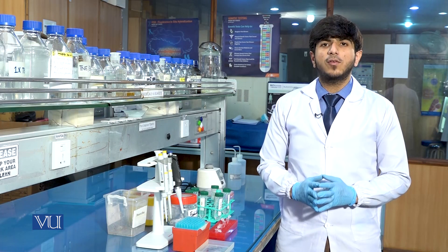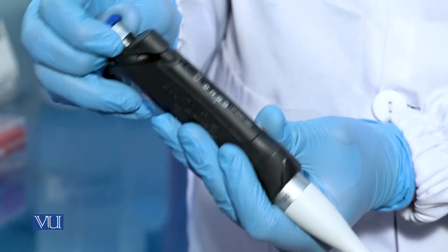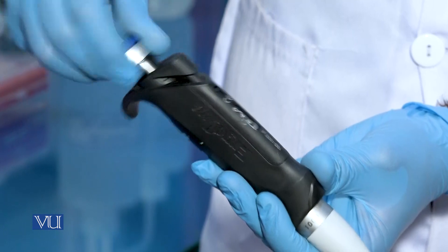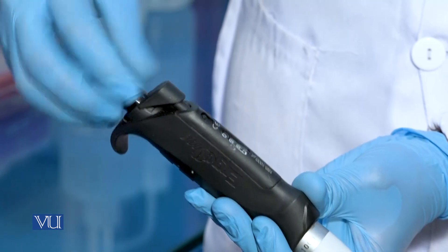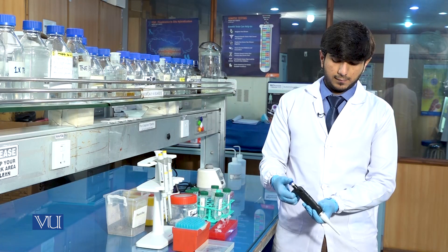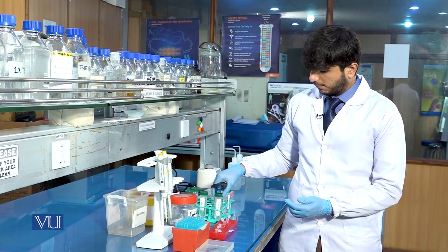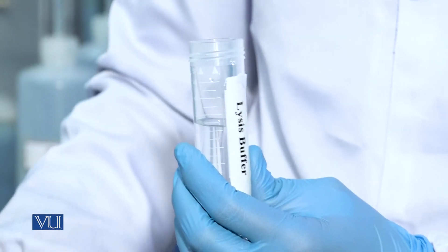After the addition of 200 microlitres of blood sample, we will add 1000 microlitres of lysis buffer. We will pick the pipette which is 100 to 1000 microlitres and set it at 1000 microlitres. Now we will add 1000 microlitres of lysis buffer in each sample.